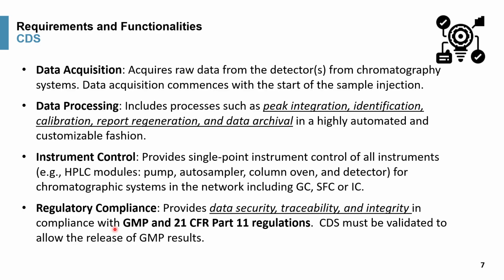For regulatory compliance, one expects the CDS provide data security, traceability, and data integrity in compliance to the GMP regulation and also to the regulation pertaining to electronic data, such as 21 CFR Part 11.